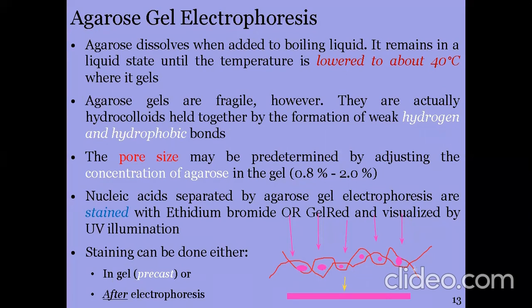bromide molecules. And one more thing, ethidium bromide is actually positively charged. Ethidium bromide is positively charged, and DNA is negatively charged. So they will be partial positive, and the DNA is actually partial negative, and the ethidium bromide will bind there, and it will move in the direction.